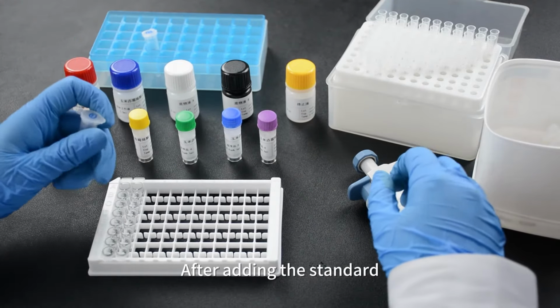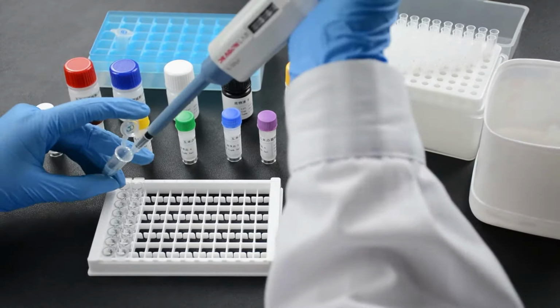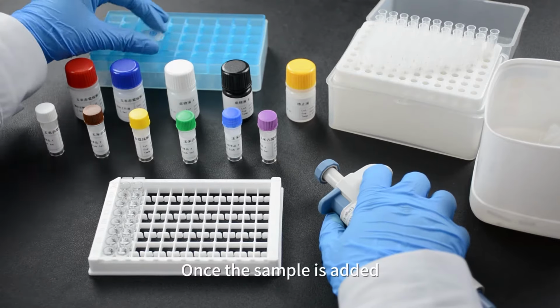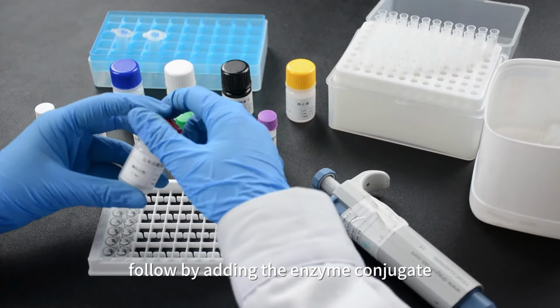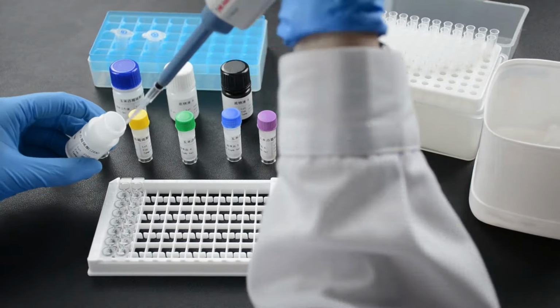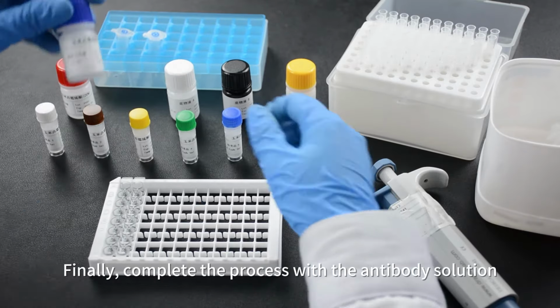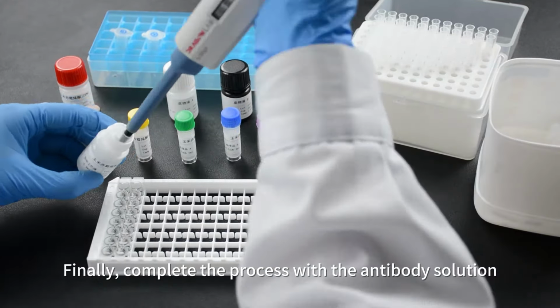After adding the standard, proceed to add the sample. Once the sample is added, follow by adding the enzyme conjugate. Finally, complete the process with the antibody solution.